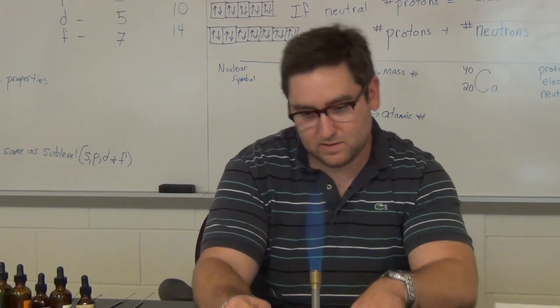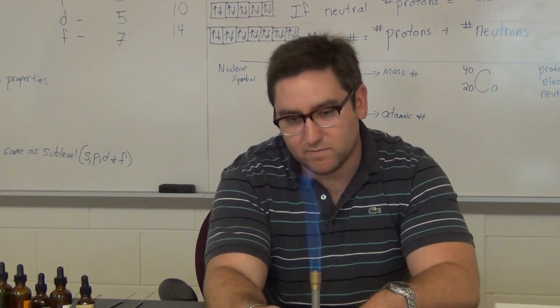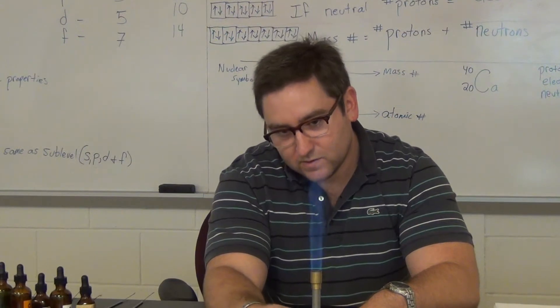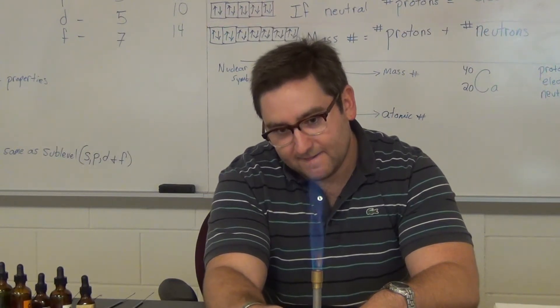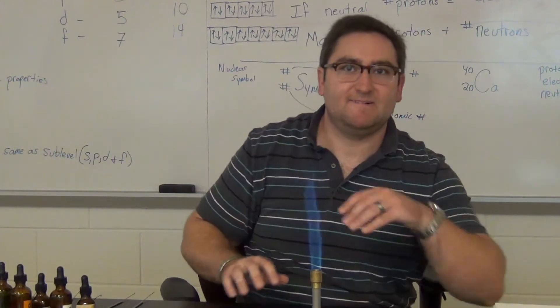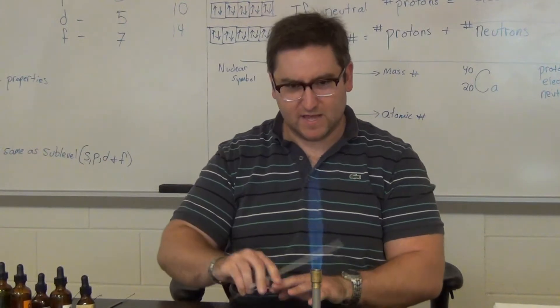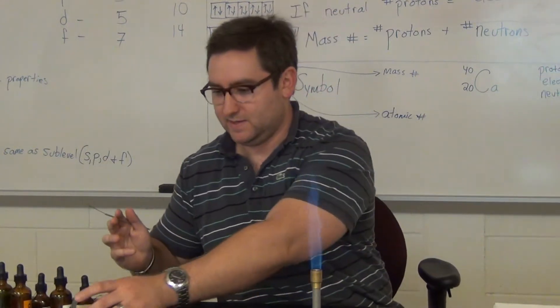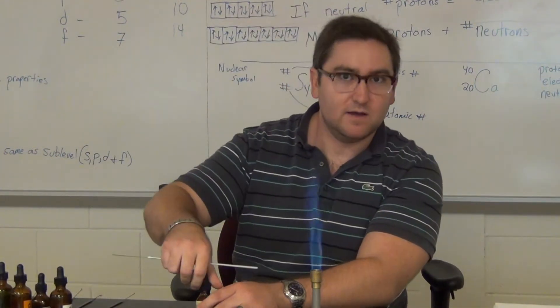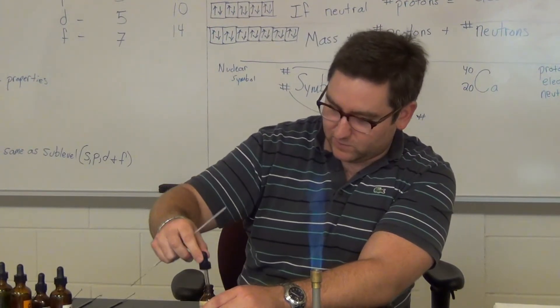This is the flame test. For the circles, just leave that out — we'll go straight down the list. If you can't see the colors, I'll flip all the lights out. So the first one we're going to do is calcium chloride.